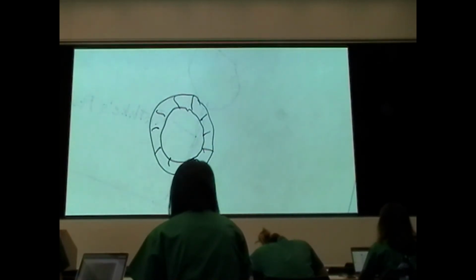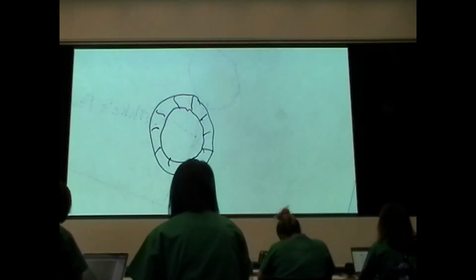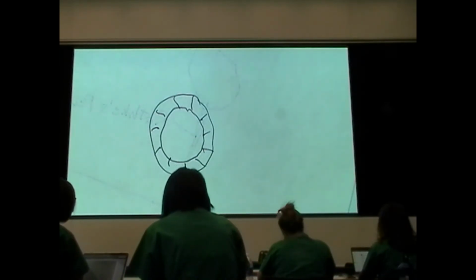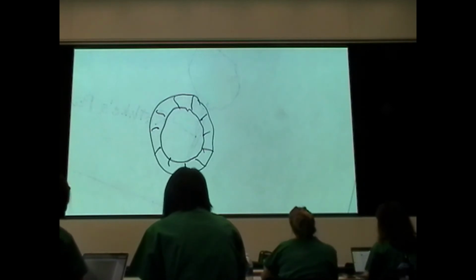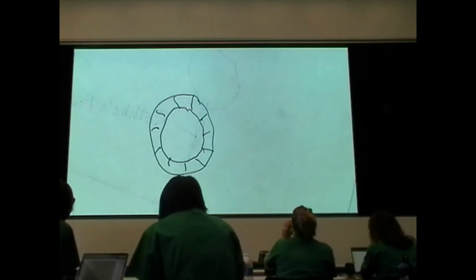That epithelium is simple cuboidal epithelium, although under certain circumstances that epithelium may get very low, so that we can talk about low cuboidal epithelium. But it's a simple, one-cell thick structure.